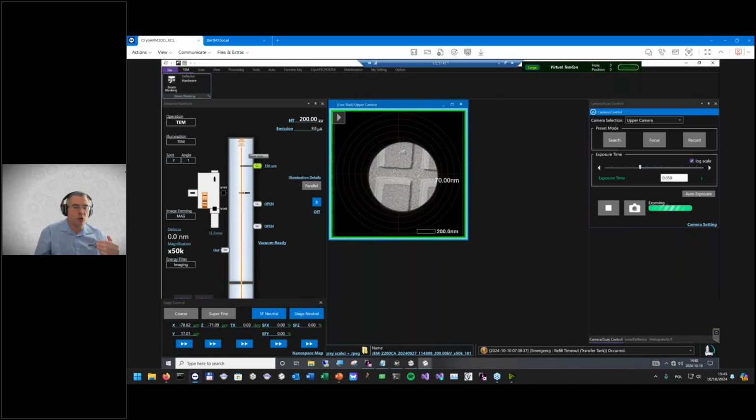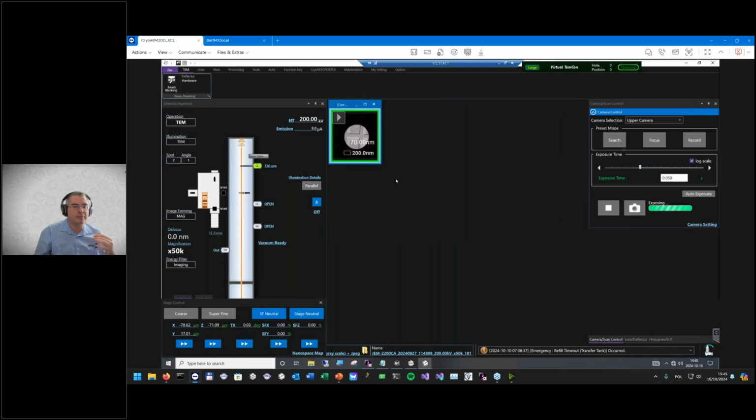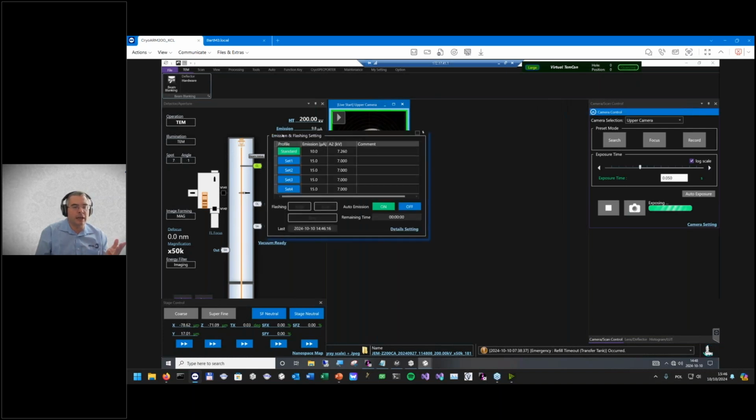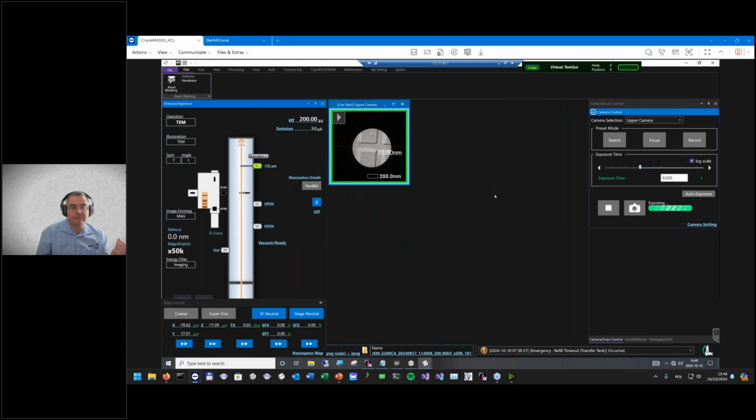Usually, when the connection quality is not that great, what you can do is make this live view as small as possible. This means that the amount of information that has to go through the connection is lower, and the proper compression may kick in and basically make the experience more smooth. But saying this, TemCenter is fully adapted for remote work. I do not have any panels at home.